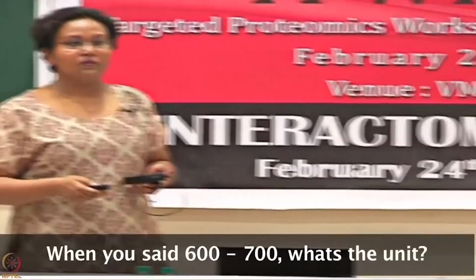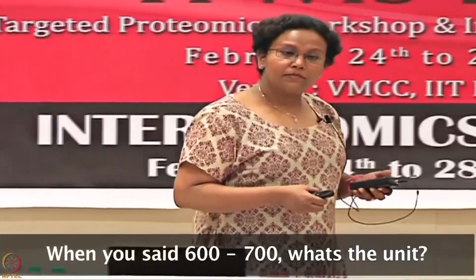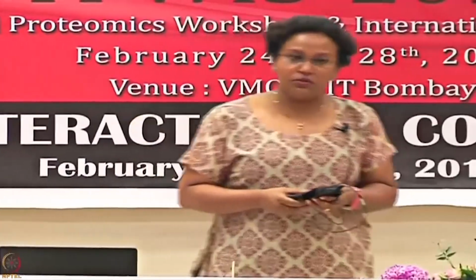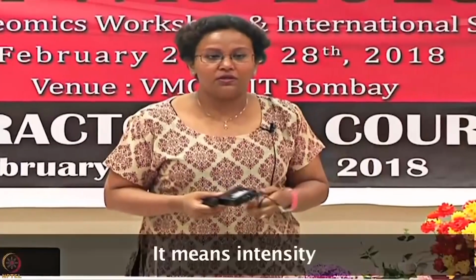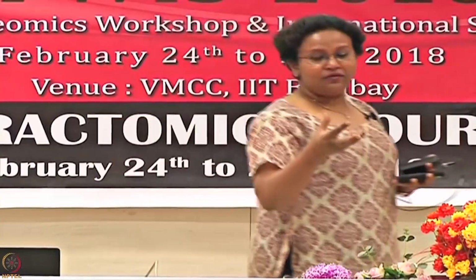How about when you say 600, 700, what's the unit? RUs, resonance unit, response unit. Yes, exactly. Like I said, it is related to the refractive index. So the change in mass will change the refractive index, and that is related to your response unit.